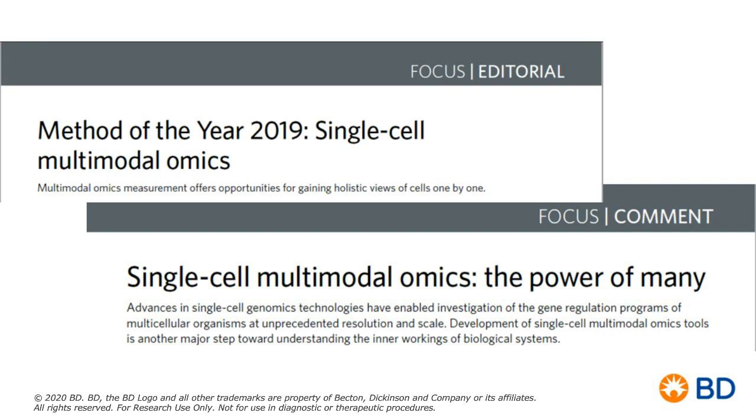So there was another question about the scanner and the Rhapsody Express, 2 different components. Joe, would you want to discuss that a little bit about the different parts of the Rhapsody system? Yeah, so as mentioned, there's 2 main components of the system, the scanner and the Express. The Express is essentially where the meat and potatoes of the assay occurs. It's where we isolate the single cells and harvest messenger RNA. It can be used in conjunction with the scanner.